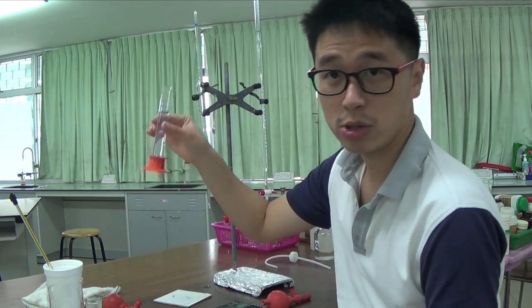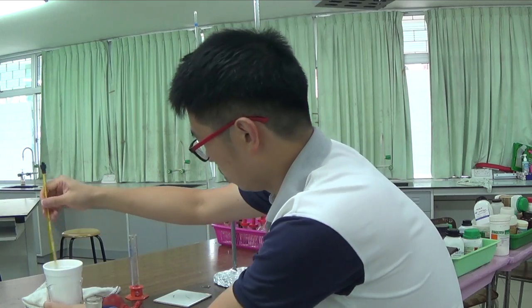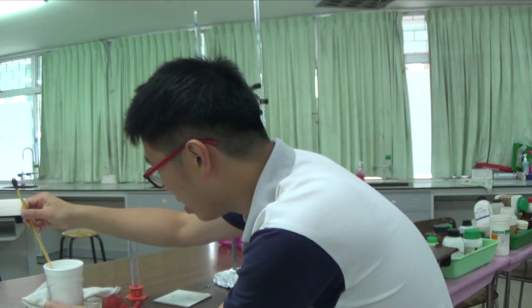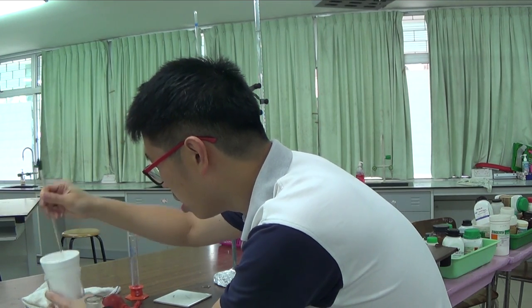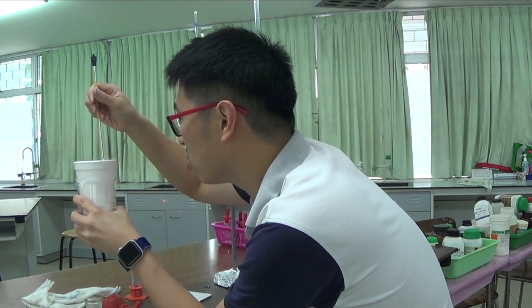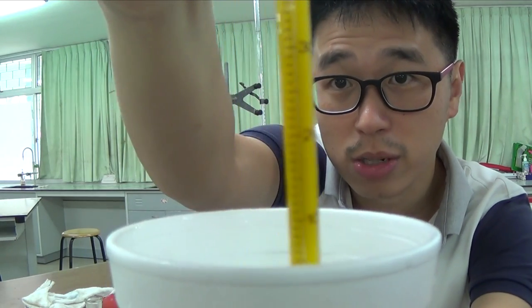And now I have my solution ready. Chuck it in. Stir it. And see where the temperature rises up to. It's gone up to around 32.0. So give or take, it's still around the same temperature.